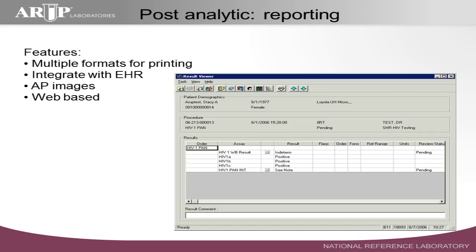However, LISs of today still have the ability to print paper charts, because we still have to produce some paper charts and perform the faxing function to get those to the right people. And so there's a lot of different ways you can format those reports. Those are all parameters you configure in the LIS. And you place them in different sections.